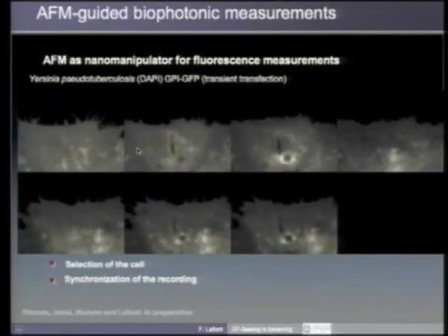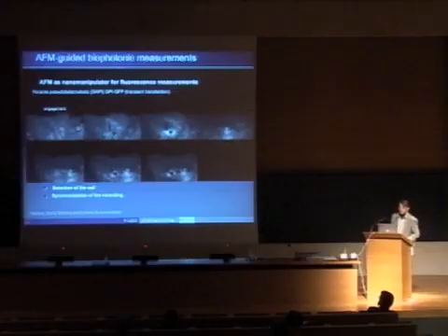So when we engaged the cantilever and the tip onto the host cells, what we saw first is a recruitment of all these molecules around the bacteria. But the bacteria are fixed on the cantilever. They can't be internalized. They are really stuck on the cantilever. On this tip we actually had 3 kinds of bacteria. So these ones, those ones, and all those were living bacteria. And here you've got a dead bacterium that we killed before putting it on the cantilever.